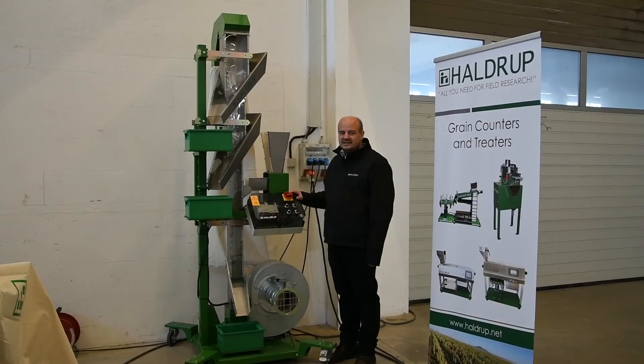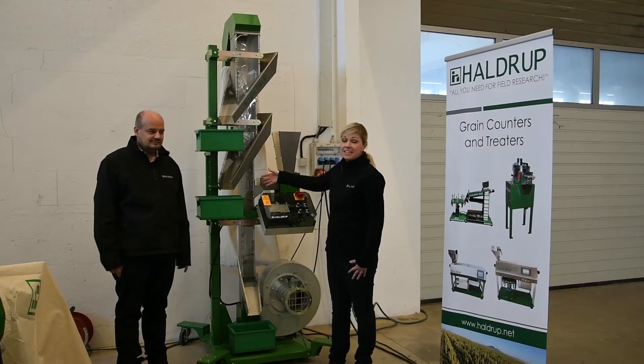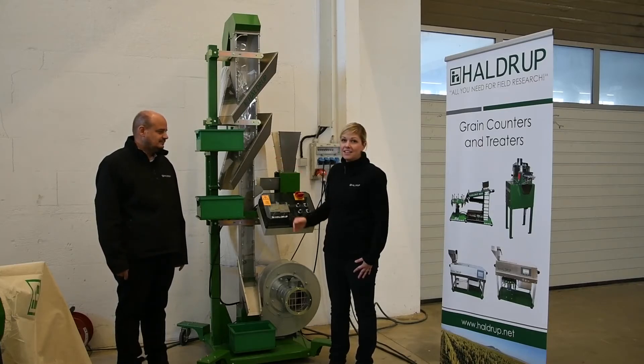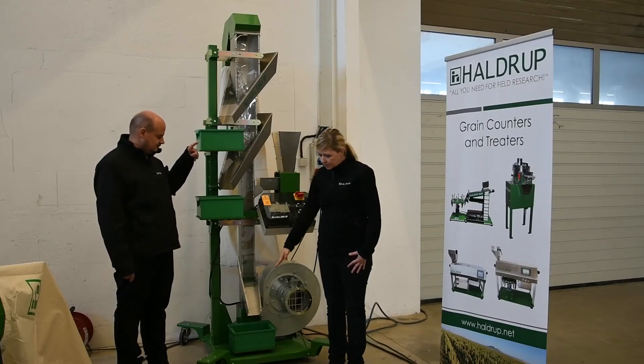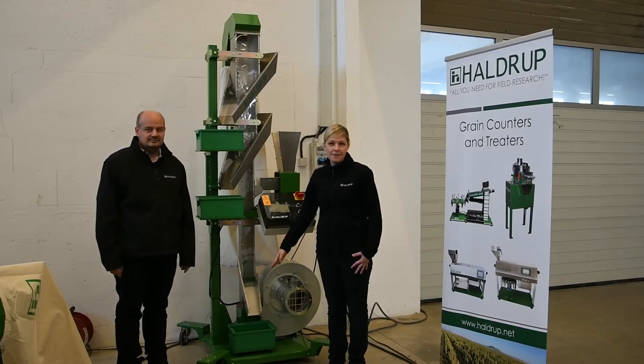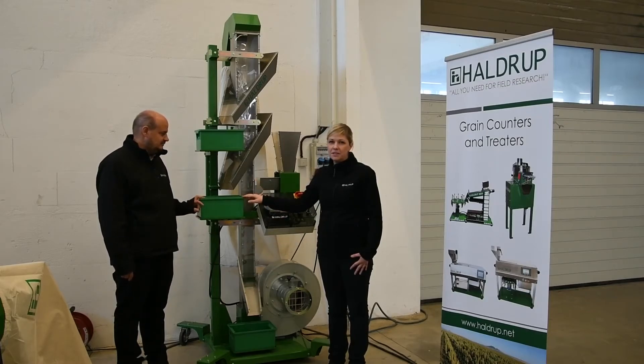For the additional cleaning of seeds or other material like insects, we have our HALDRUP Cleaning Column DC20. This machine sorts and cleans with air and it can sort into three different fractions. On the bottom you get the best sample, the best material. In the middle you get a medium-cleaned material.